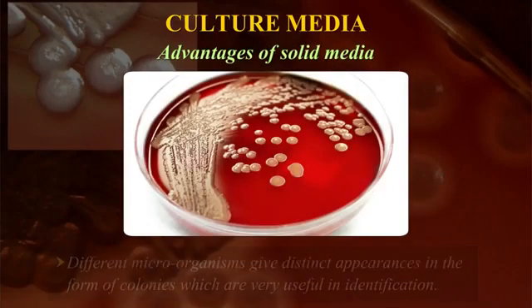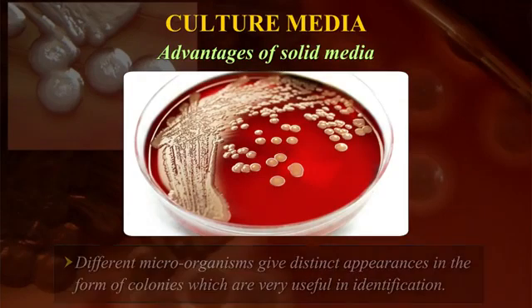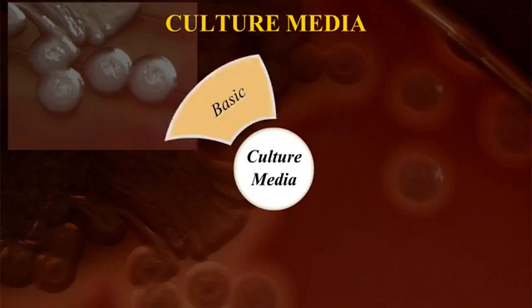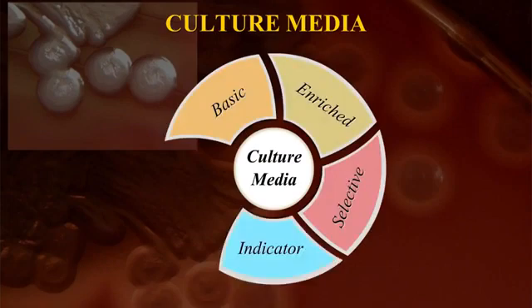On solid media, different microorganisms give distinct appearances in the form of colonies, which are very useful in identification. Also, solid media are indispensable for the isolation of pure cultures. That is, an organism can be easily separated and grown as a pure line, thus helping in identification. Culture media can also be classified as basic, enriched, selective, indicator, and transport.